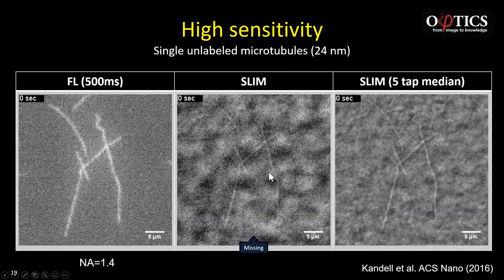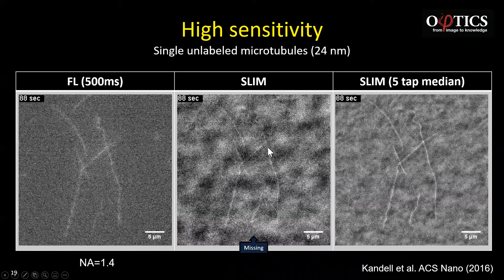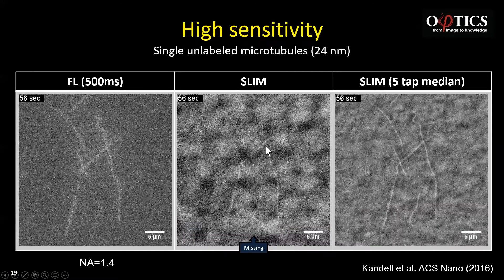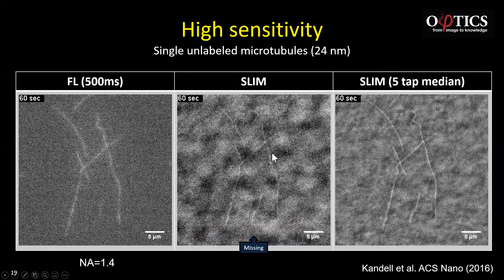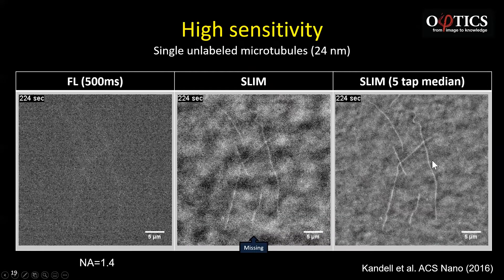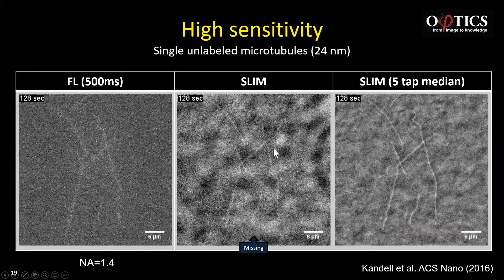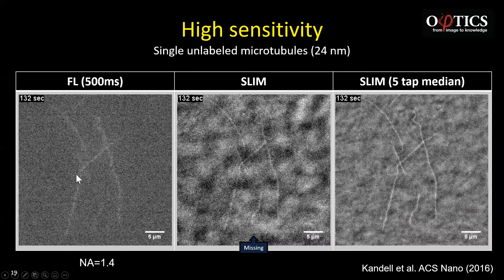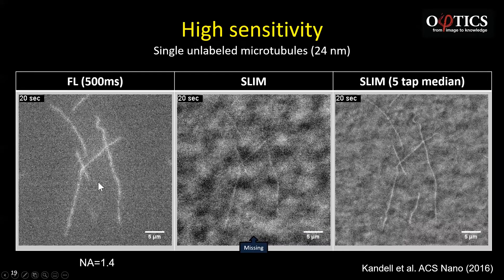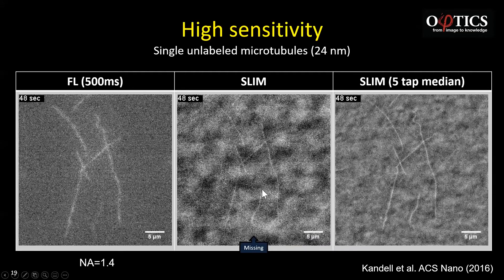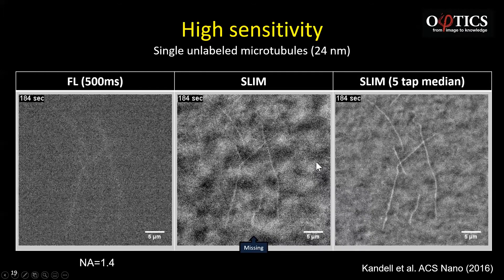One last point about how sensitive SLIM is: you're looking at single microtubules on a piece of glass. These are 24 nanometer diameter structures that are visibly shown with high contrast in SLIM. With time-domain averaging you can increase the signal to noise further. The technique generally used for microtubules is fluorescence, but for continuous imaging of two or three minutes, the fluorescence goes away through photobleaching. We showed how we can image the transport of these microtubules over many hours, which is impossible to do with other techniques.